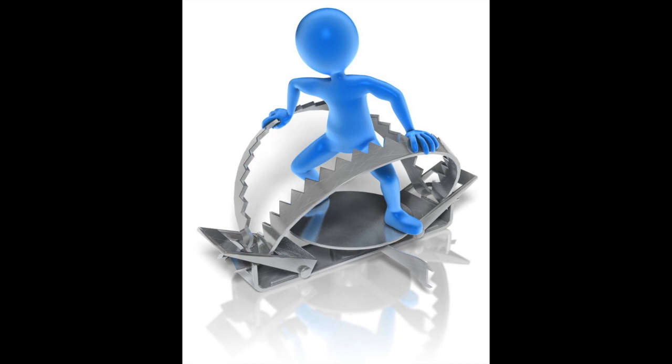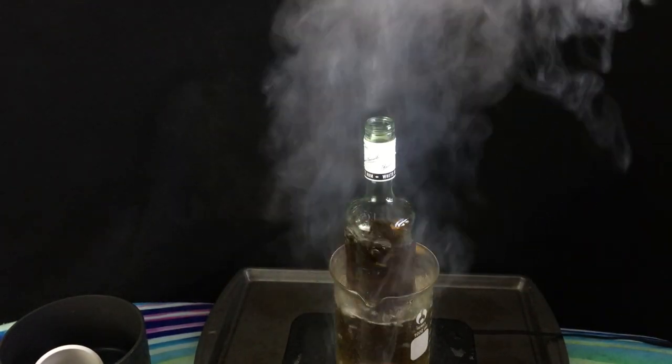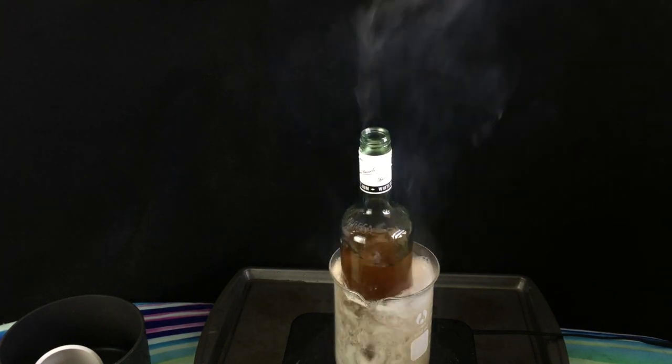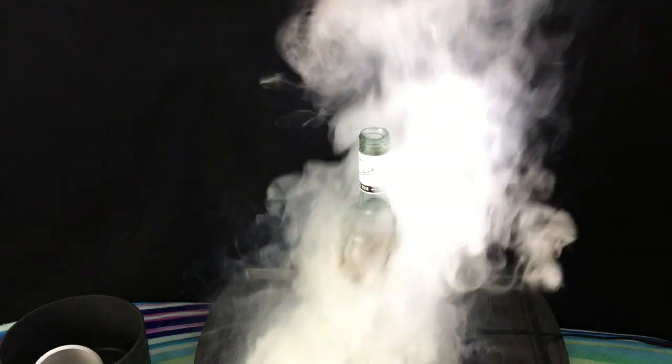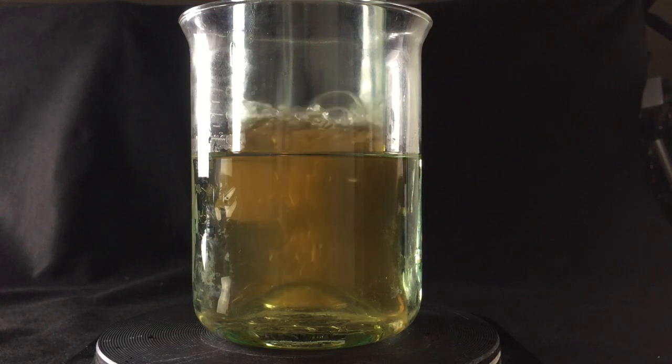A minute ago, I spoke of the danger of allowing one of these makeshift boiling flasks to overflow — let me show you what I'm talking about. There are no boiling chips in this bottle, and so the boiling isn't smooth. It's chaotic, as the liquid becomes superheated and burps out its energy in large, randomly spaced spasms. If they combine in just the wrong way — bam — you get a big blast of boiling water right in your face. Some of that burst will fall down into the oil, where it boils vigorously enough to cause it to overflow, and catastrophe. All of this is very easy to avoid if you take the proper precautions — just use boiling chips so the problematic boiling doesn't happen.